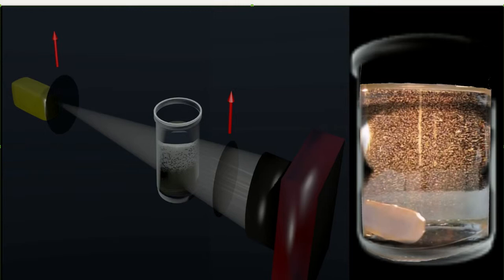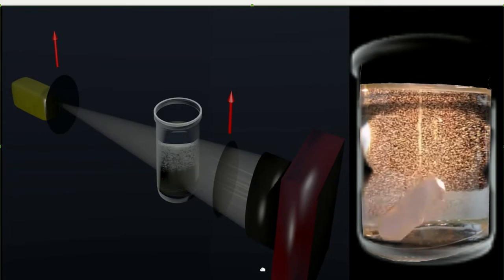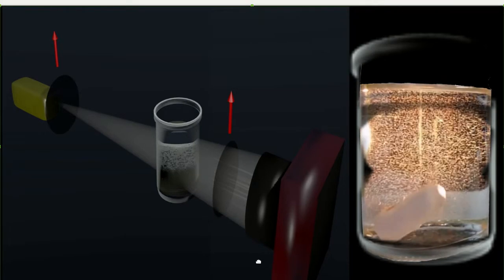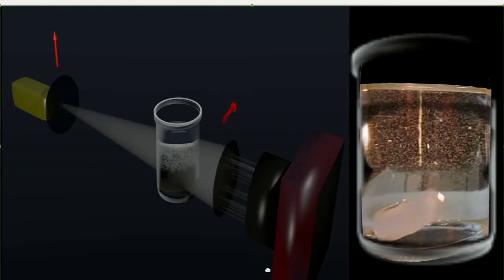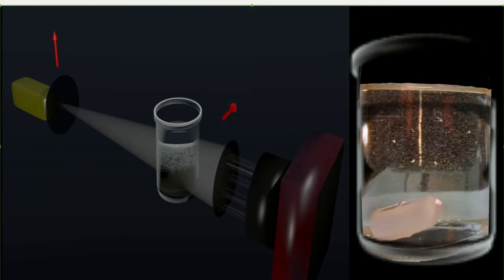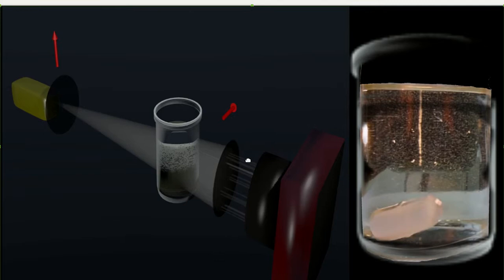However, if the analyzer is oriented such that its polarization state is perpendicular to the polarizer, then the only light that comes through is light that has been optically rotated, in this case shown here.